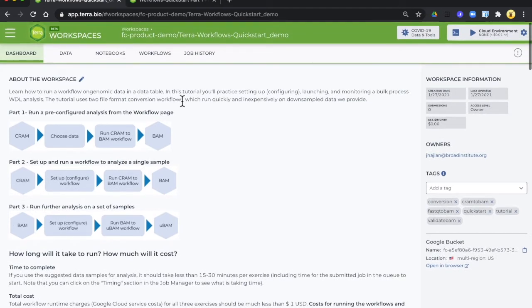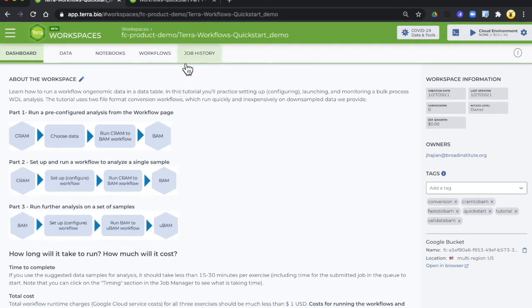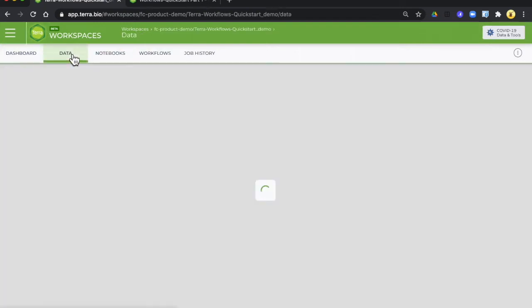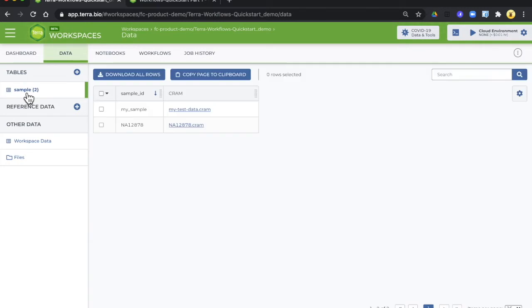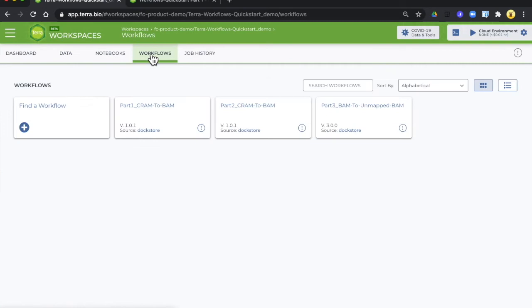The first step is to simply run a workflow. It's mostly set up for you and this exercise is just to show you the mechanics of running a workflow on Terra. We're going to run on a sample that's in the sample table which is already in the workspace and you're going to start by going to the Workflows tab and selecting the part one cram-to-bam workflow.